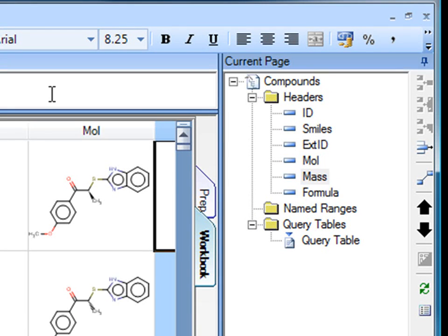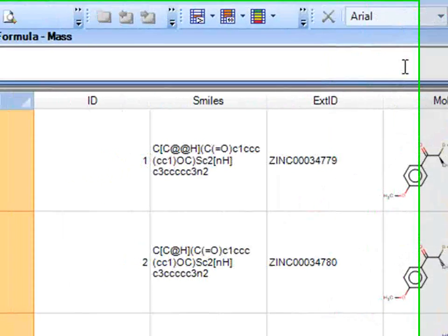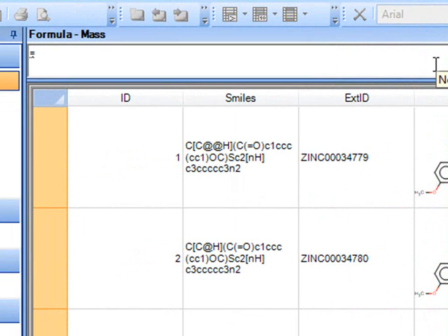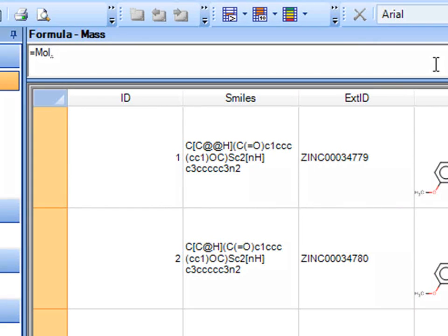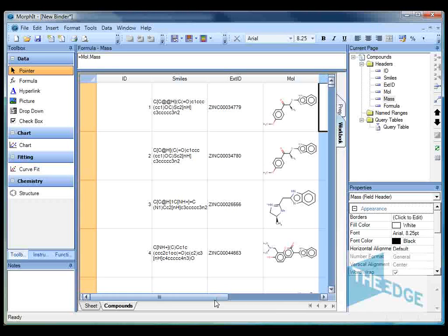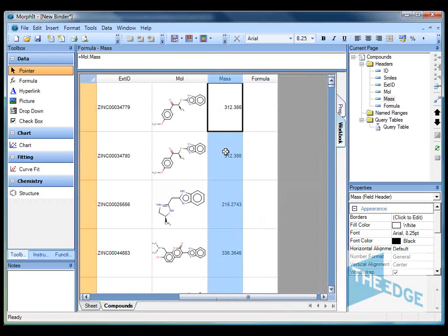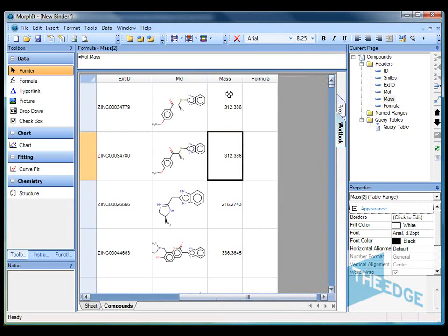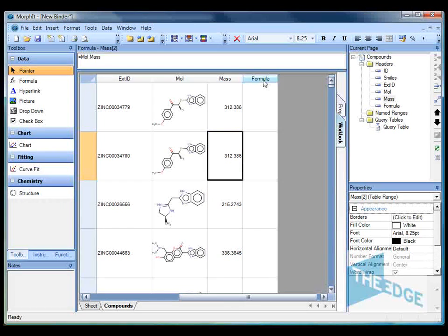So first of all let's calculate the formula. We do that by referencing the column that contains the structure type and then adding the mass value. If we scroll to the right here you'll see that we've now calculated the molecular mass for all of these structures.